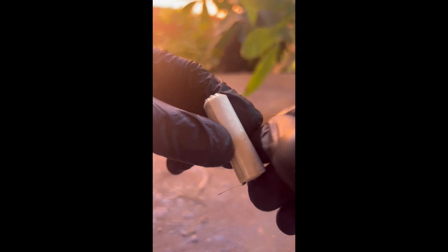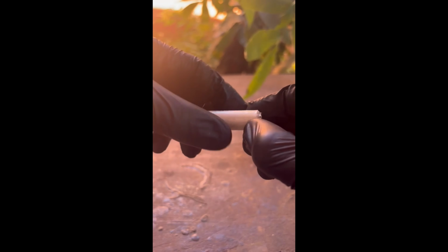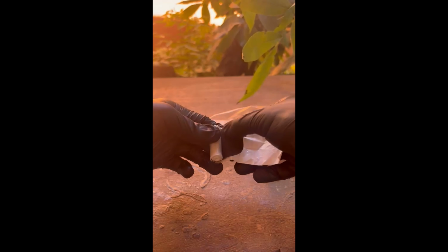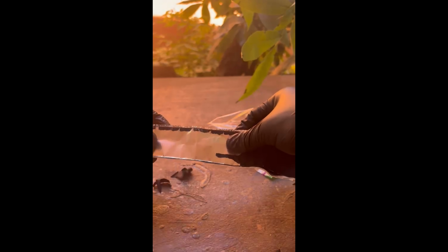I later on continued by taking the plastic core off with my hands by just unrolling it and got these foils. The one in black is iron disulfide, which is the cathode of the battery.